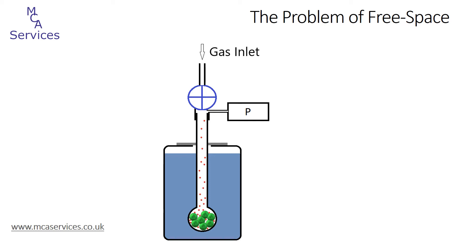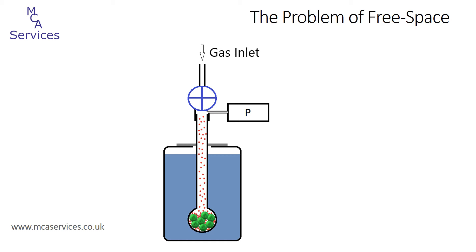The problem with low surface area materials is that the volume adsorbed onto the sample becomes very small relative to the analysis tube free space volume. As we increase the relative pressure we find that although the volume adsorbed onto the sample increases, so too does the volume and therefore the number of molecules in the free space. Once the number of atoms or molecules adsorbed onto the sample becomes very small relative to the number within the free space, we can no longer ascertain the number adsorbed to the sample accurately. At this point we can no longer gather reliable and accurate adsorption isotherm data.